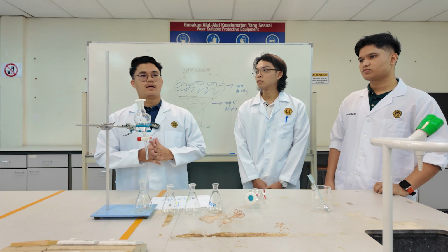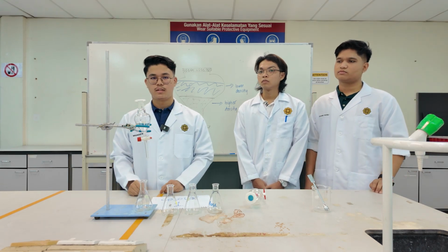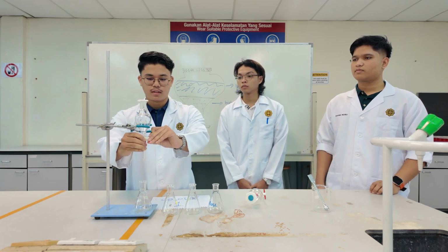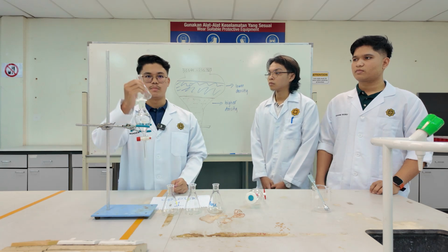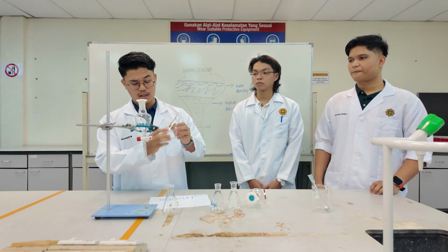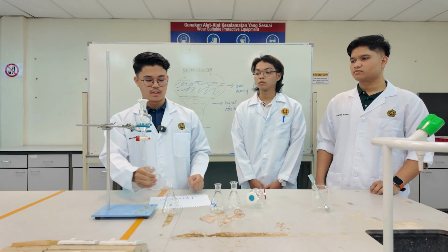We must make sure that our eye is perpendicular to the funnel. So we separate it until the bottom second layer, and you will get the mixture. After that, we use a flask, the acid flask, and separate and put it in here.